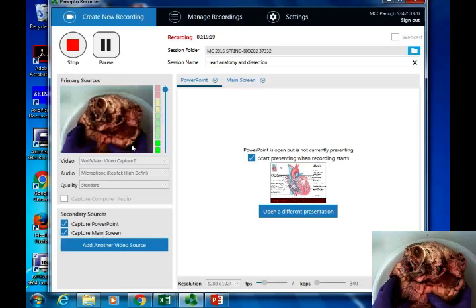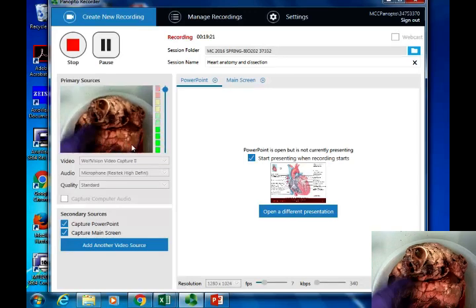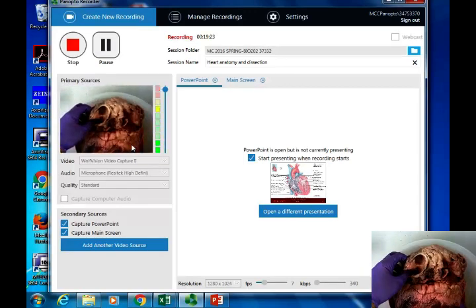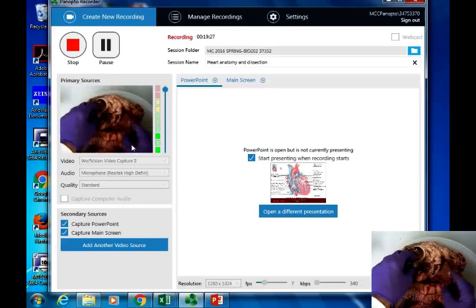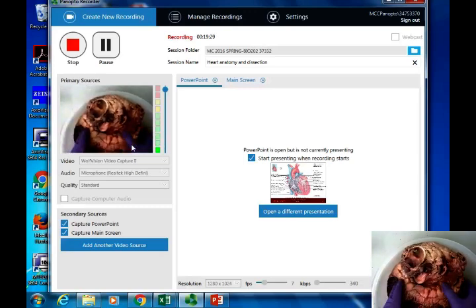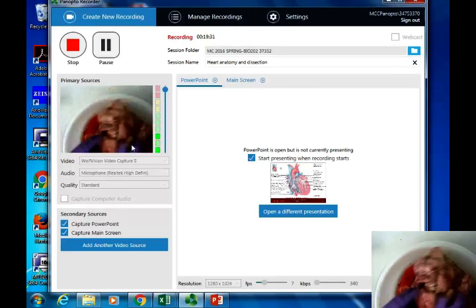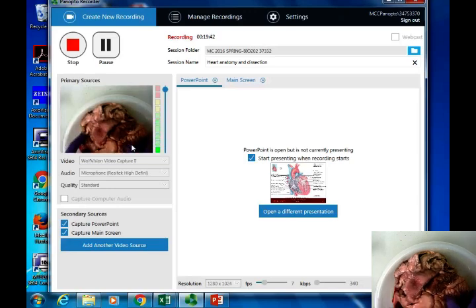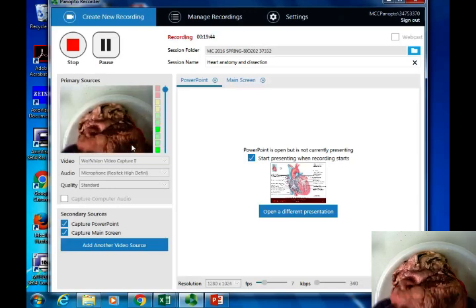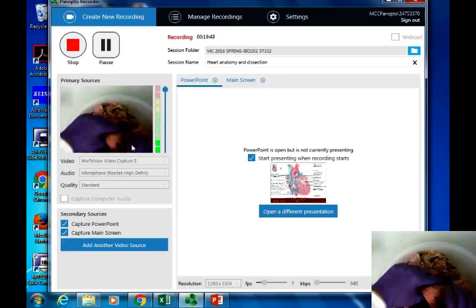Very stinky. So, yeah, you can see it's got a lot of flexibility to it, especially when you get to some of the structures like the blood vessels. So even looking here, see, that's really flexible that you see right there. So the unpreserved ones are much more anatomically correct. And then even you can see the wall here.